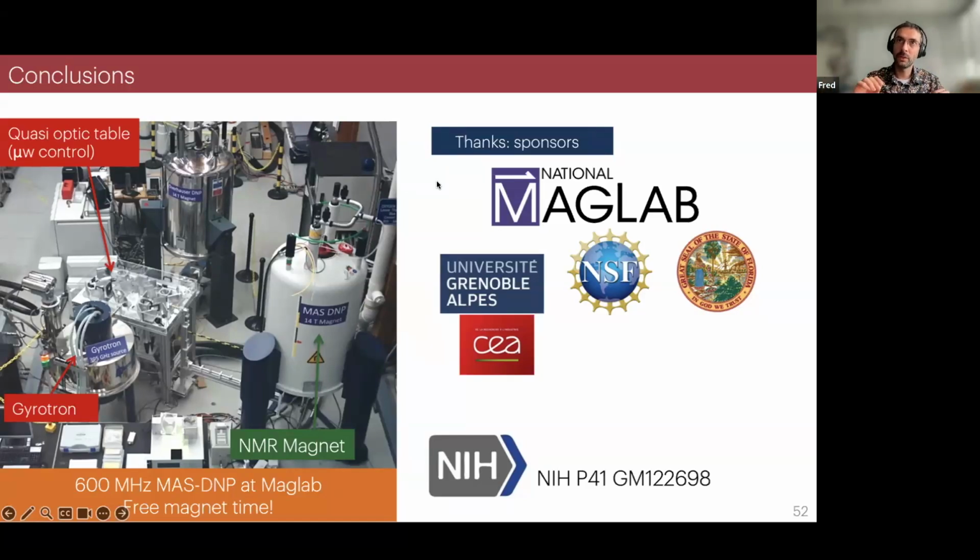Now, this is true at 100 Kelvin. When you go to very high field, even at 100 Kelvin, then other mechanisms may start to kick in, in particular one called the direct process, and then having the high field EPR setup at the exact same conditions, static, not necessarily spinning, would really be required to understand what's going on. So if you think of 1.2 gigahertz DNP setups, I think we will start to have problems with relaxation times of the electrons in this range.